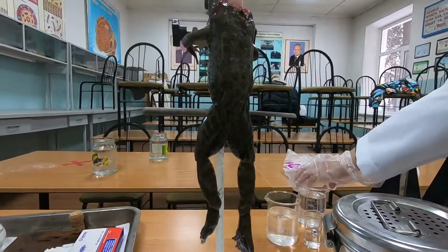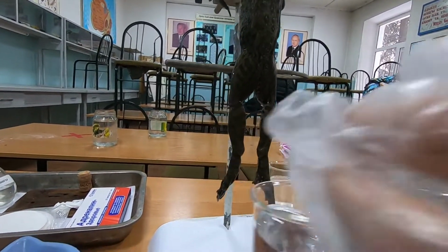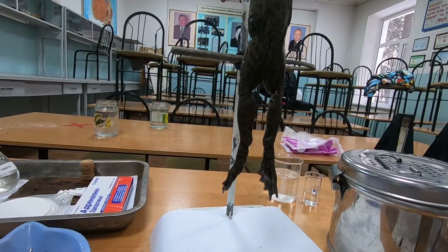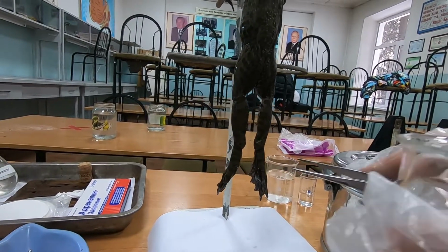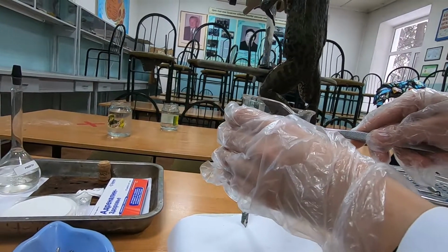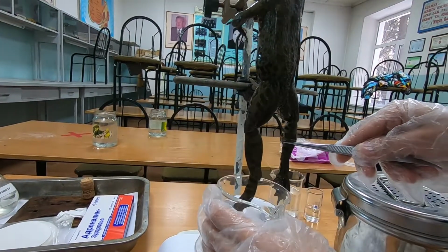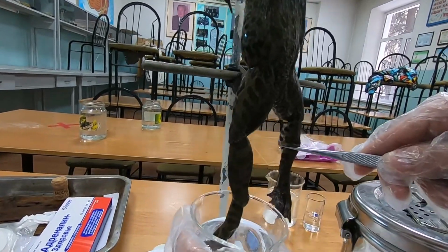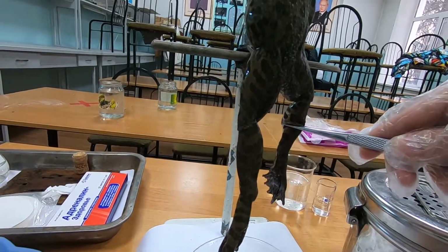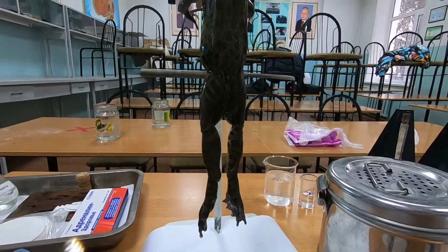Let's wash it. You can see the reaction. It is cooling it down. Now we'll leave it a minute or two, and then we'll continue.